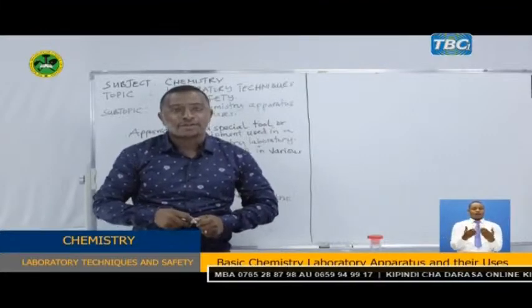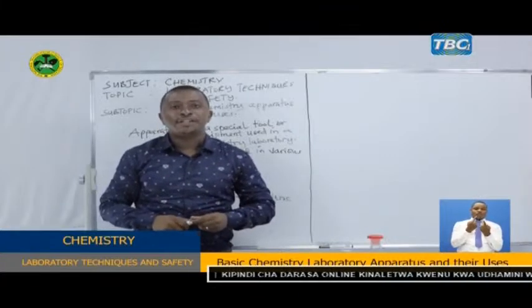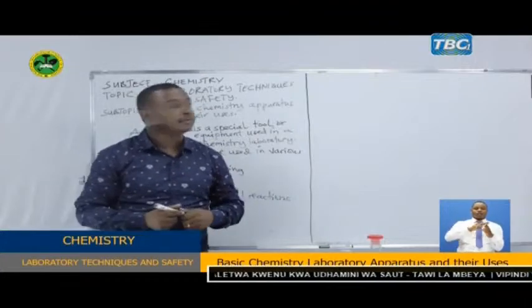Now class, today we shall be also discussing the classification of apparatuses used in the laboratory.